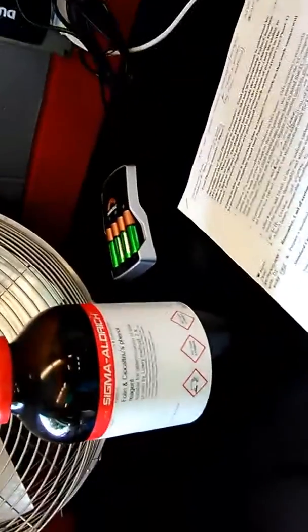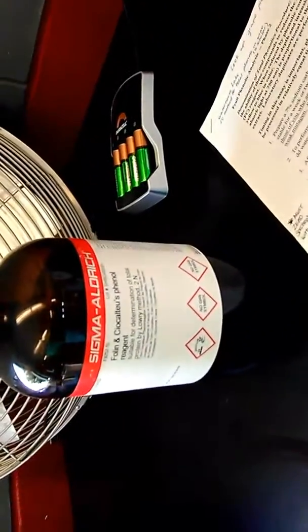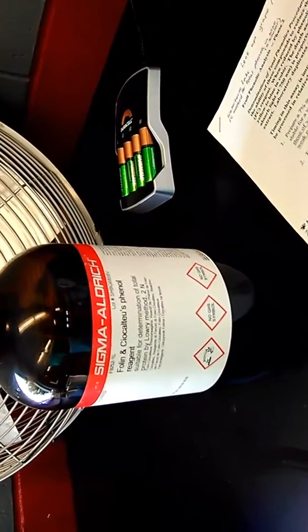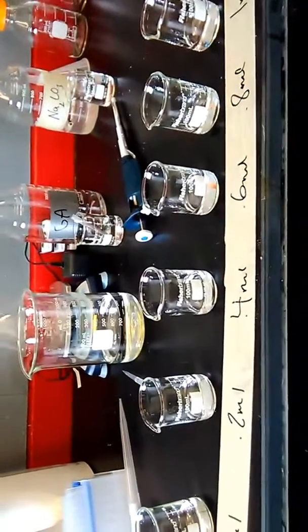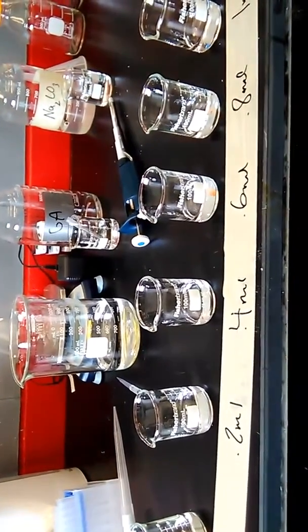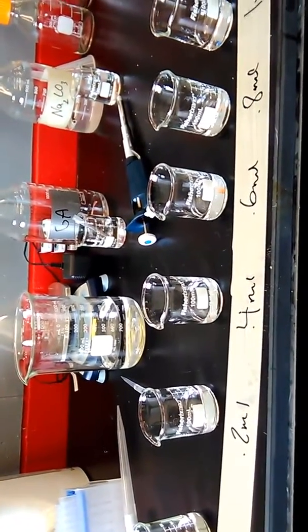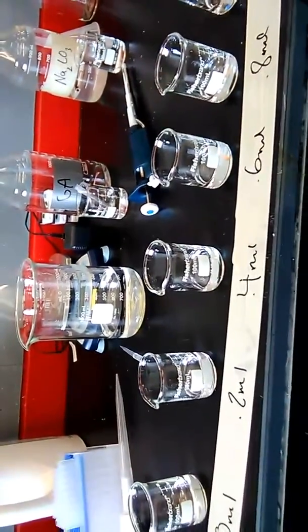We are going to add the folin reagent, the phenol reagent. And that is going to turn this yellow. And we need to be very careful adding this in because it is a mutagen.